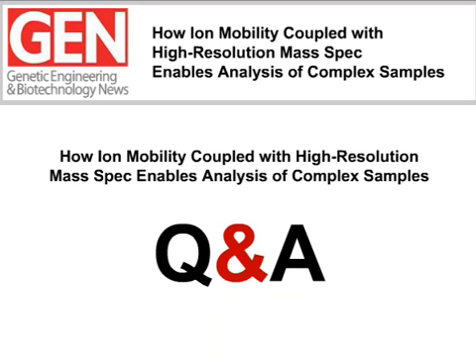Thank you, George. Aaron, do M plus H and M plus sodium ions for the same precursors typically separate in the IM separation? Okay, I'm just going to rephrase that for clarity. What we've seen is if you have a protonated or hydrogen adduct versus a sodiated adduct, it depends on your backbone structure, so actually on your molecular structure.